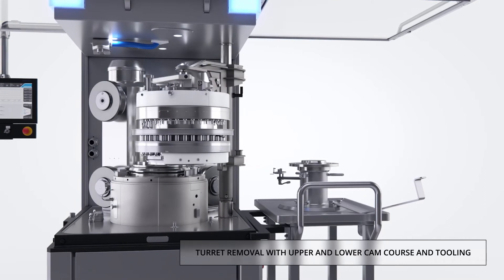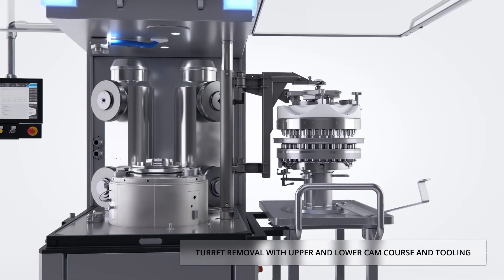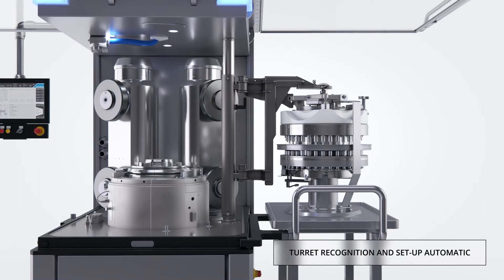A lifting arm is installed in the carrier plate and secured at the machine headpiece to facilitate turret removal and installation. The turret locking is automatic, and the control system has a turret recognition capability to permit the parameters to be set up automatically.